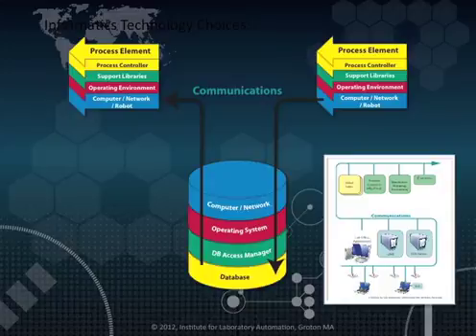The workflow diagram we looked at a few slides ago isn't a two-dimensional structure. It has depth. For example, the process elements are built on layers of software, as are the database systems, all connected over a communications network. That network can connect elements on the lab bench, shown on the bottom of the diagram on the lower right, systems used to manage the laboratory in the middle of the diagram, with connections to other laboratories and departments within an organization. When we are connecting systems to networks, we have to be aware not only of the local impact, but the impact on the entire network as well.